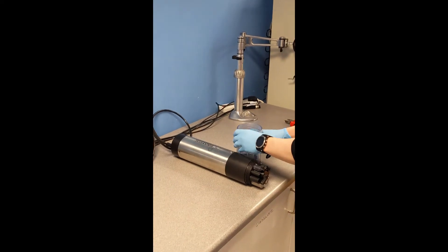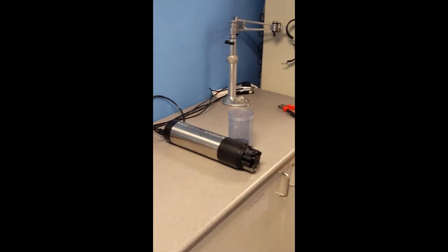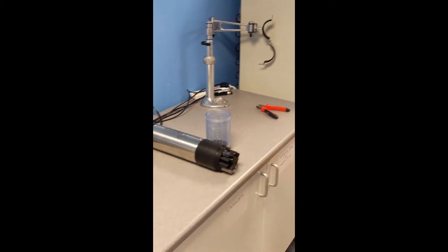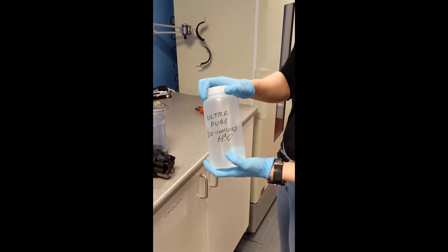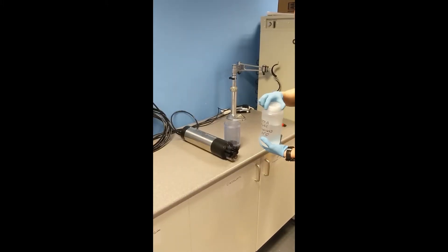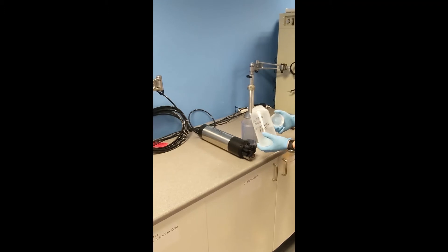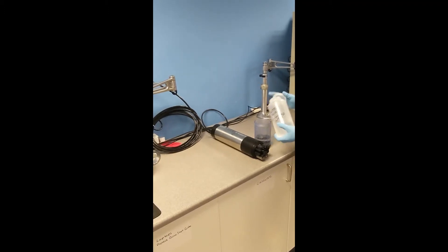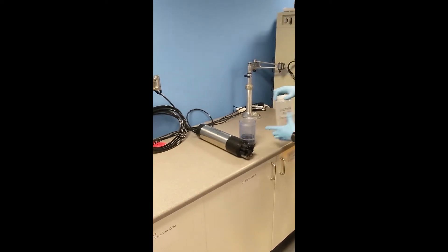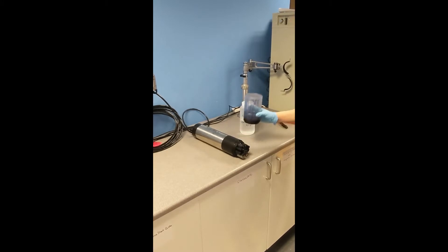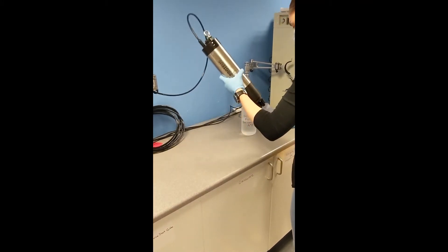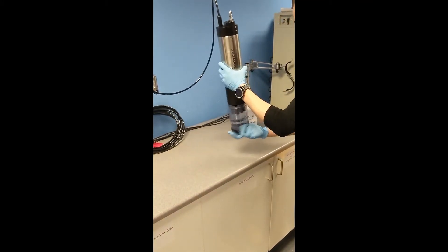With turbidity, you just need to use a fluid that has no turbidity in it. Before calibrating, you must always rinse, so we rinse with deionized water. You just pour a small amount into the cup, take the cup, screw it onto the Proteus.